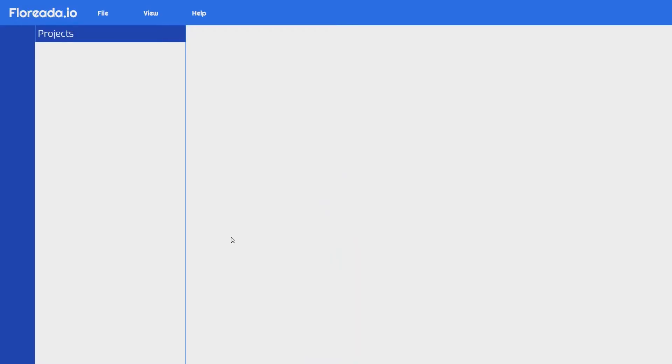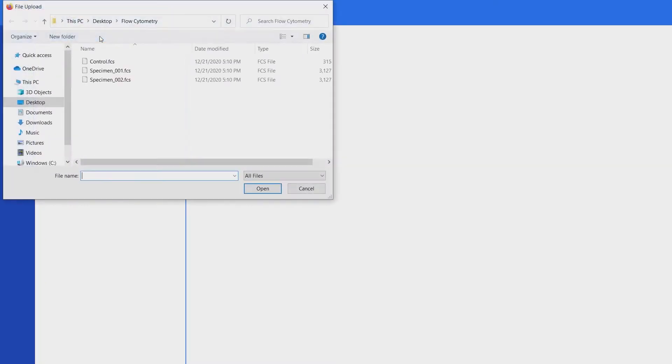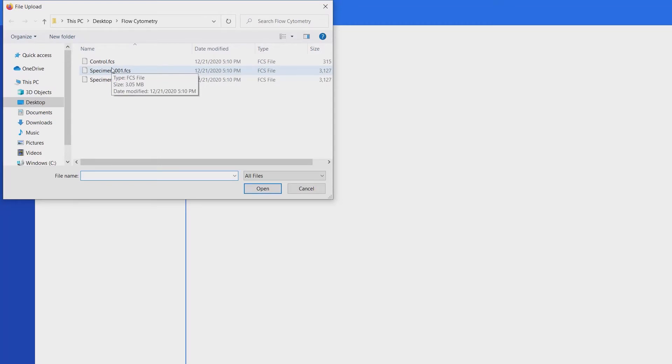Once you're there, go to the file menu and select open files. That will open up a menu where you can select any FCS file on your computer to open for analysis. We have a few test files here. I'm going to just select this first one and hit open.